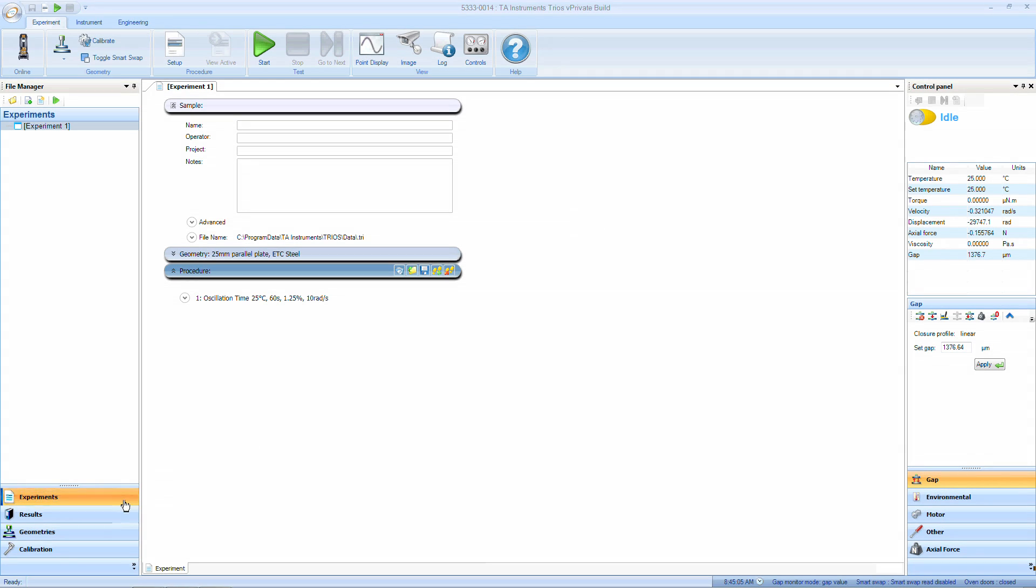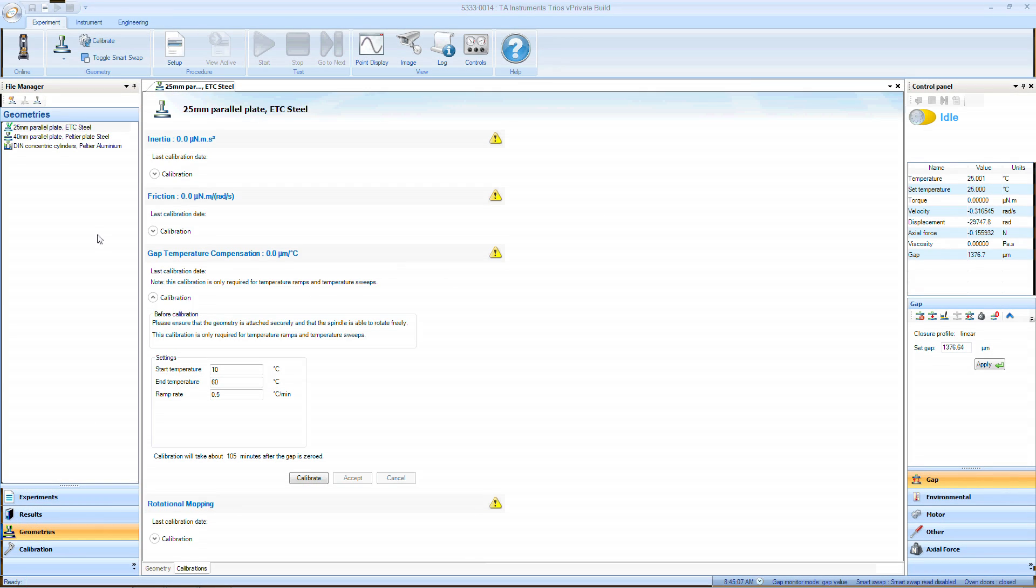To calibrate the gap temperature compensation, go to Geometry. Double click on the selected geometry and go to the Calibrations tab. Expand the gap temperature compensation calibration area. Select the temperature range and rate that exactly matches the test conditions, then click Calibrate. When complete, choose to accept or cancel the new value.